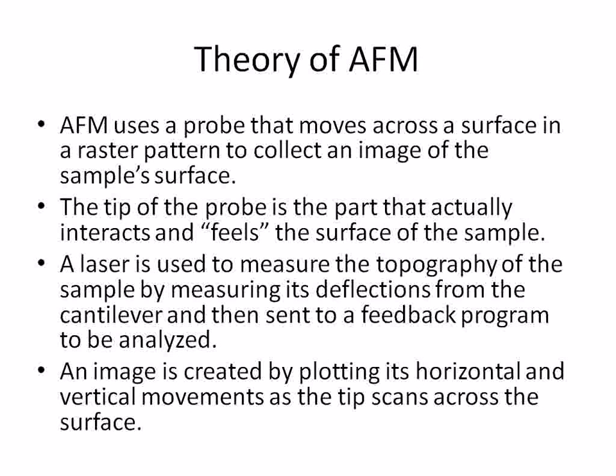The AFM collects images of a sample surface by moving the probe over the surface in a raster pattern, which means the sample moves left to right under the probe as it goes back and collects this image. As the sample moves, the probe gets pushed up and down as it moves across the surface, which allows the probe to measure the height and therefore create an image. There's a tip that interacts with this sample that I'll show you in a picture in just a minute.